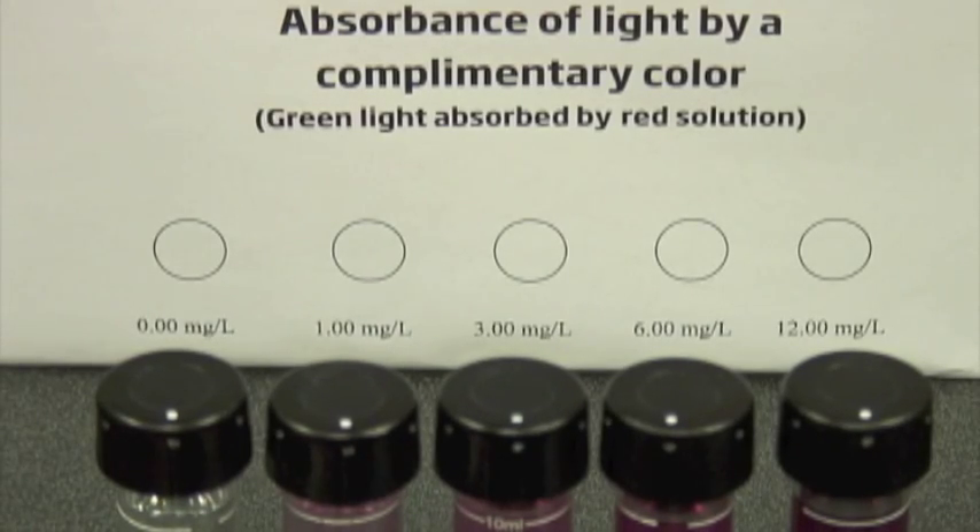So what we have here is a series of solutions. We go from 0 to 12 parts per million — first our 0, then our 1, and then our 3, 6, and 12. But before we begin all that, we're actually going to show you what our little green laser looks like in air. As you can see, it's fairly bright, no major problems.